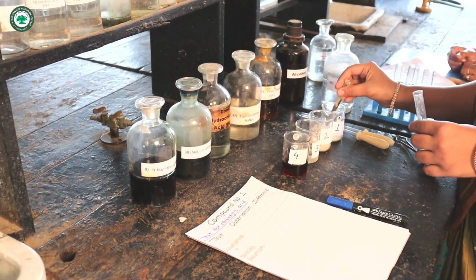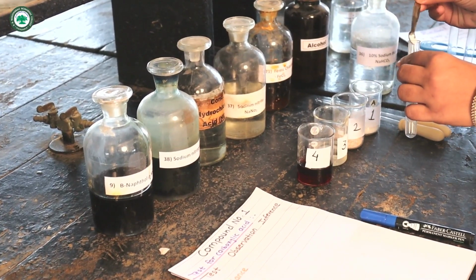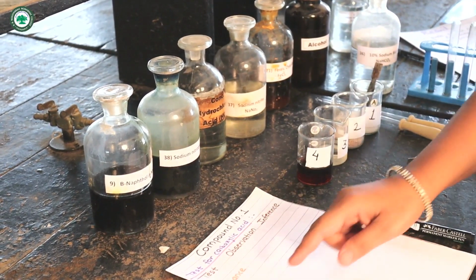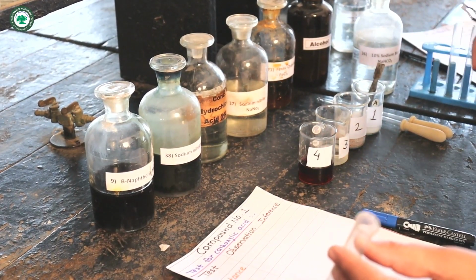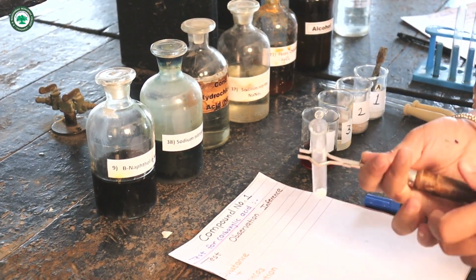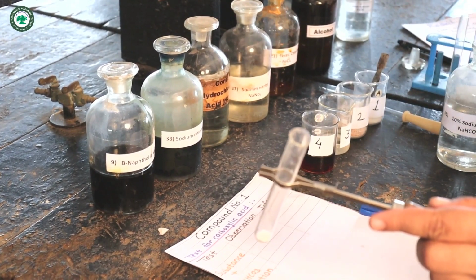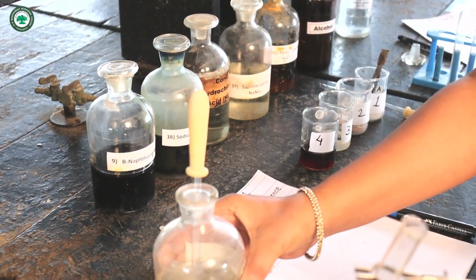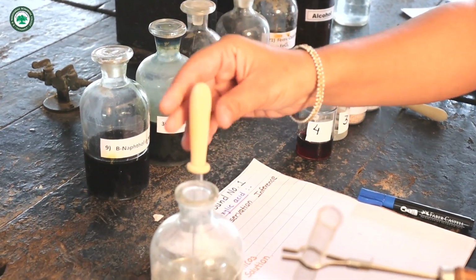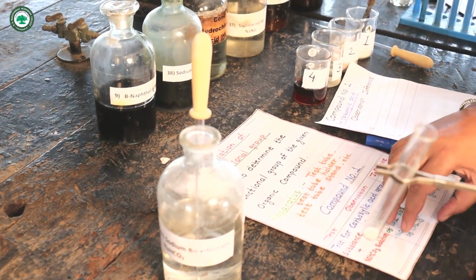Take a small amount of compound first in a clean dry test tube. Before adding sodium bicarbonate solution, the test tube holder is attached to the test tube. Then add sodium bicarbonate solution.